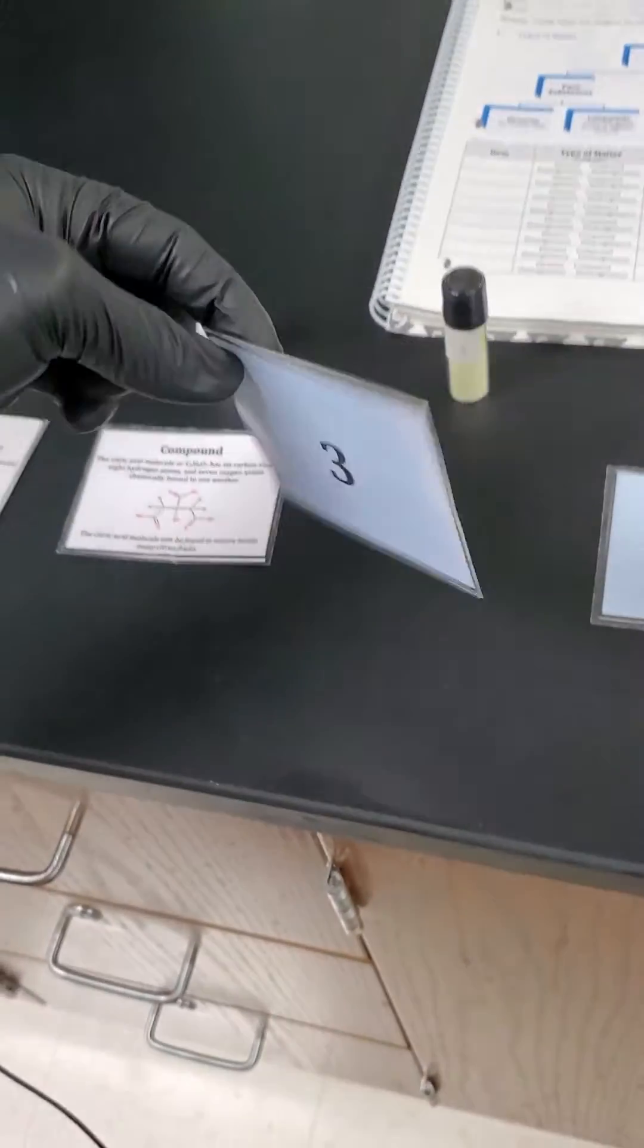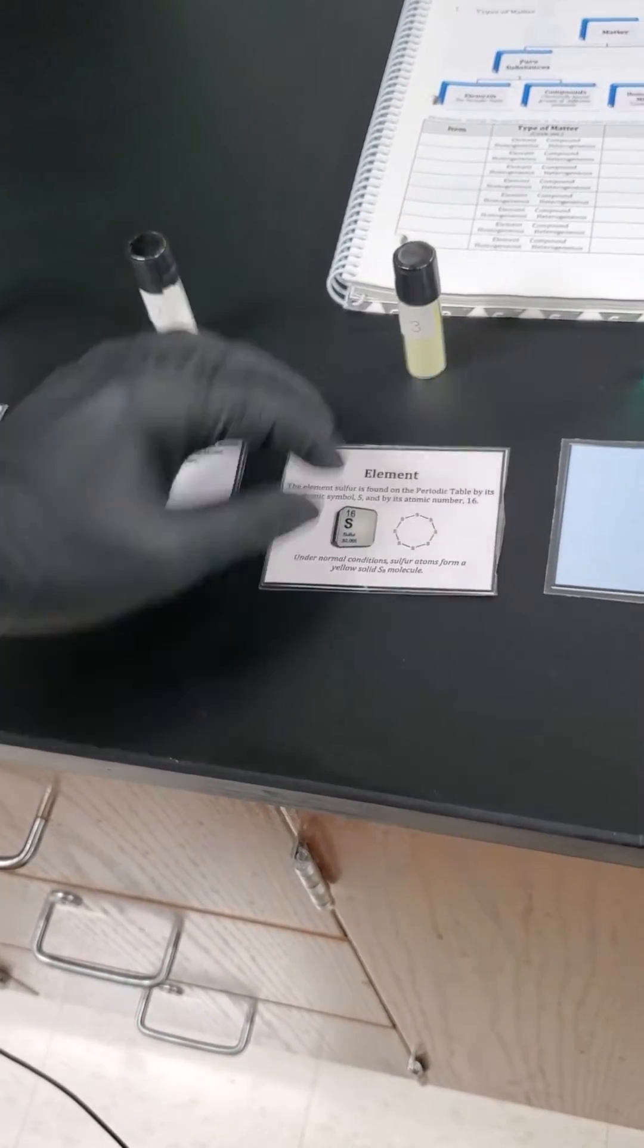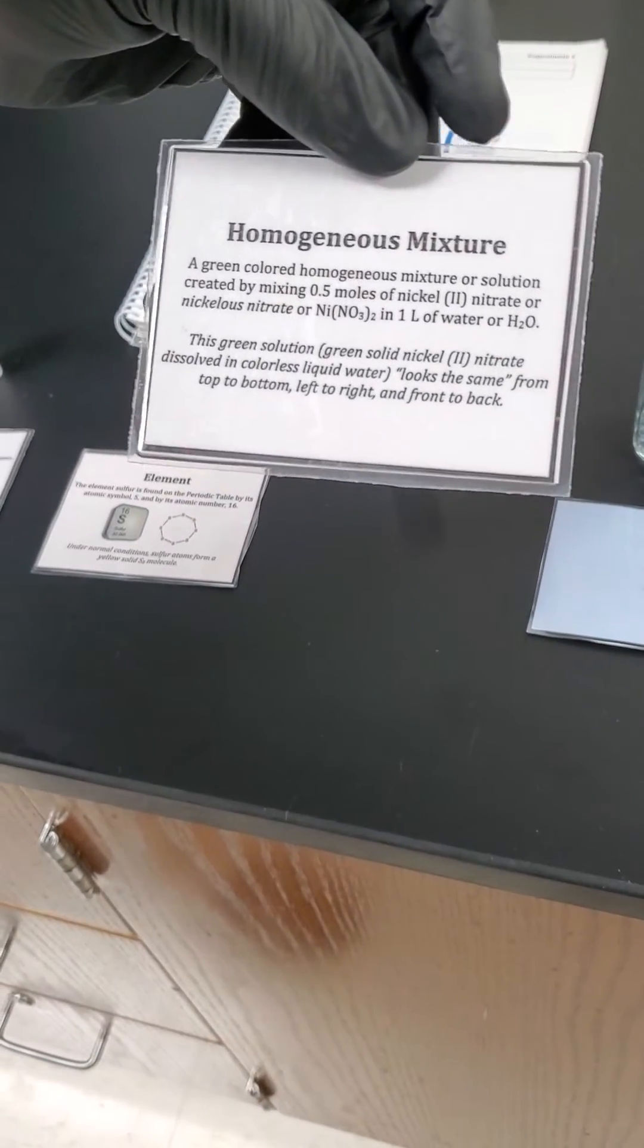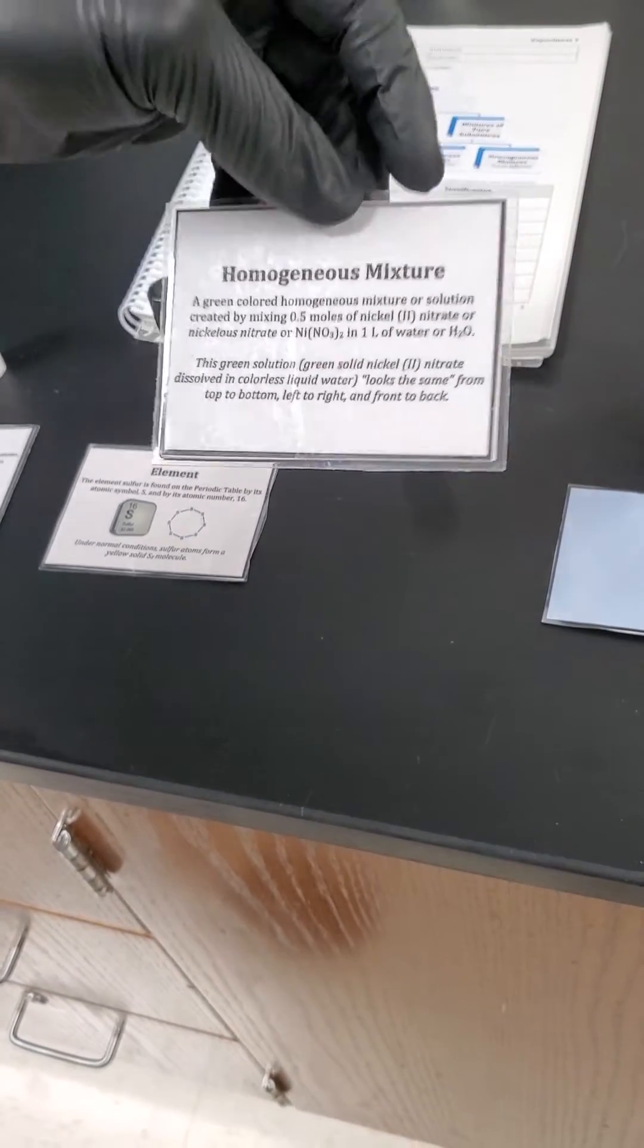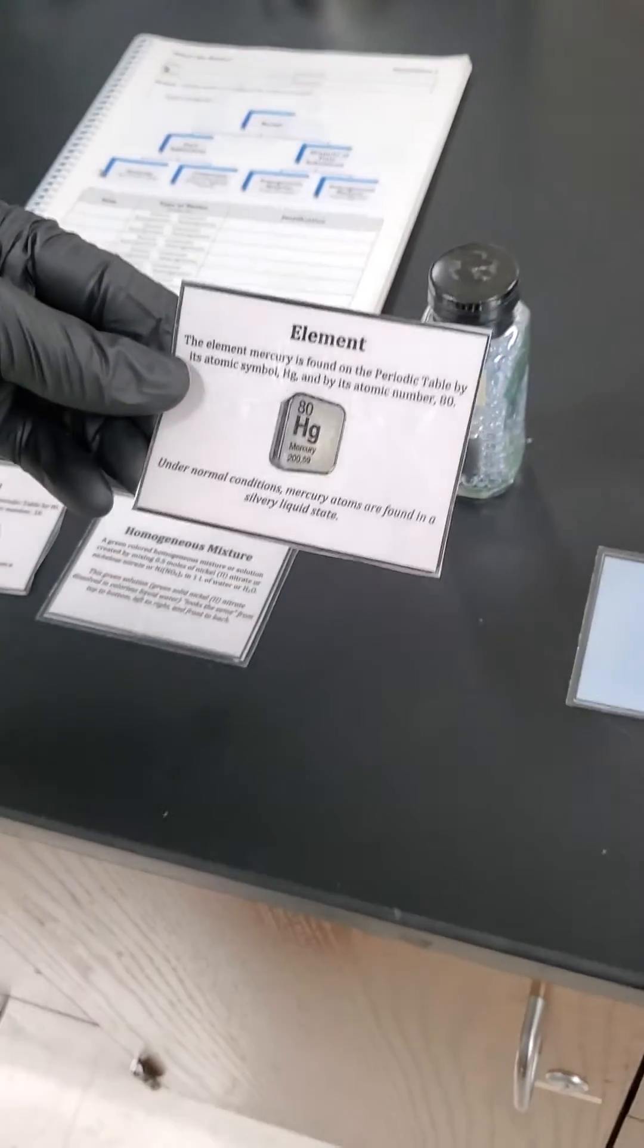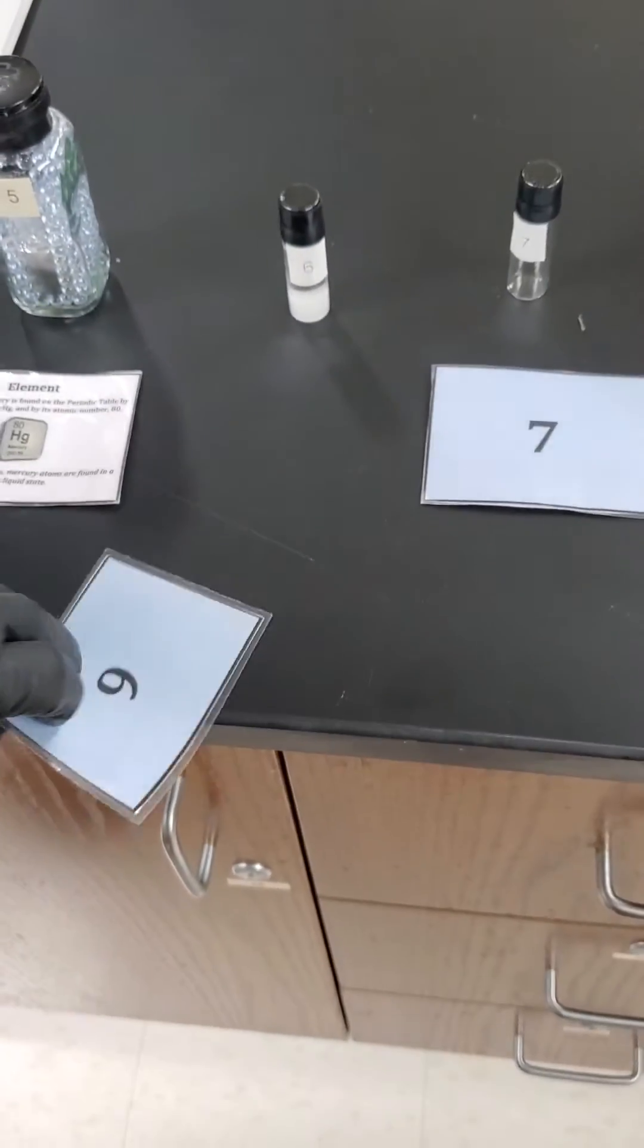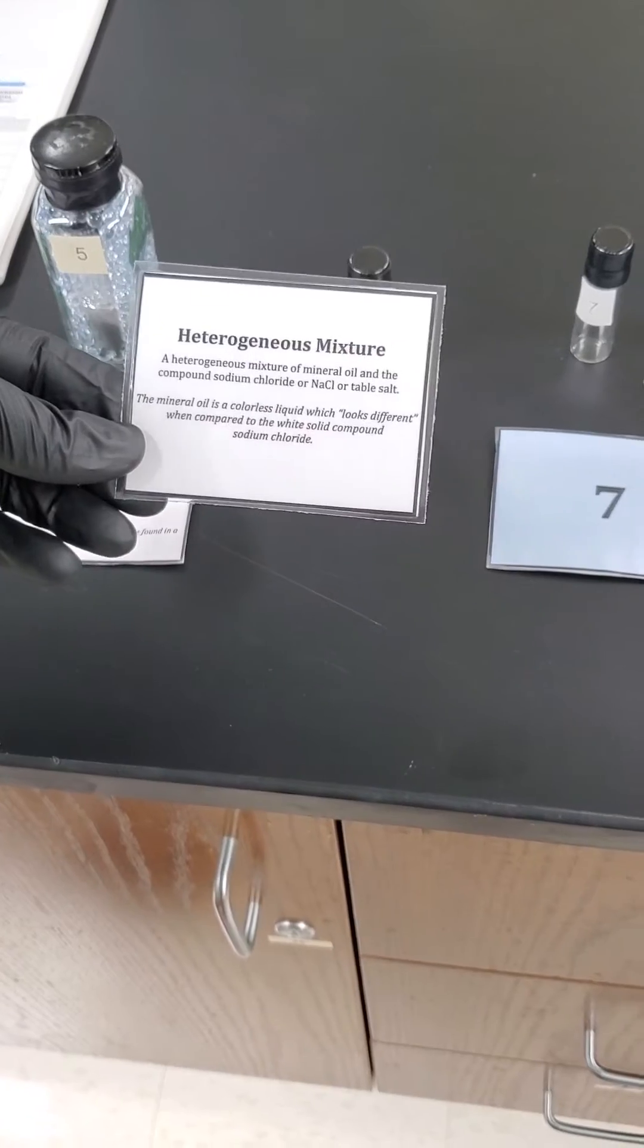Number three, the yellow dust. If we'd open it, you could probably smell it and figure it out pretty quickly. This is the element sulfur. Would smell like a rotten egg. Number four was that kind of green solution or fluid. This is a homogeneous mixture of water and some nickel nitrate that's mixed in. All solutions. Great synonym for homogeneous mixture. Any kind of number would give that away on a bottle. This one definitely the easiest of the bunch. Silver fluid, or at least silver liquid in this case, elemental mercury.